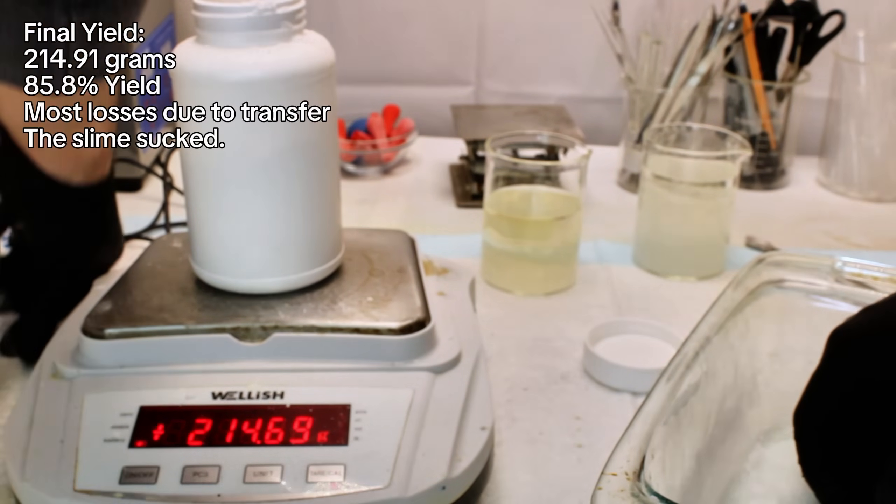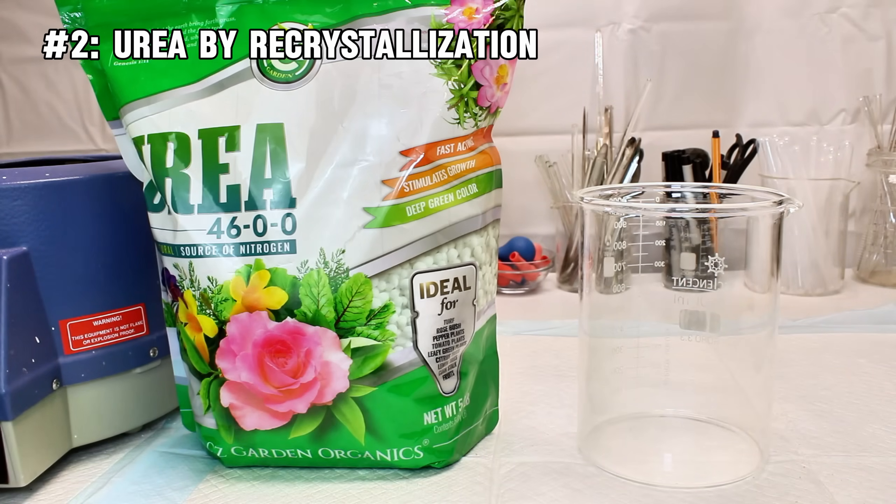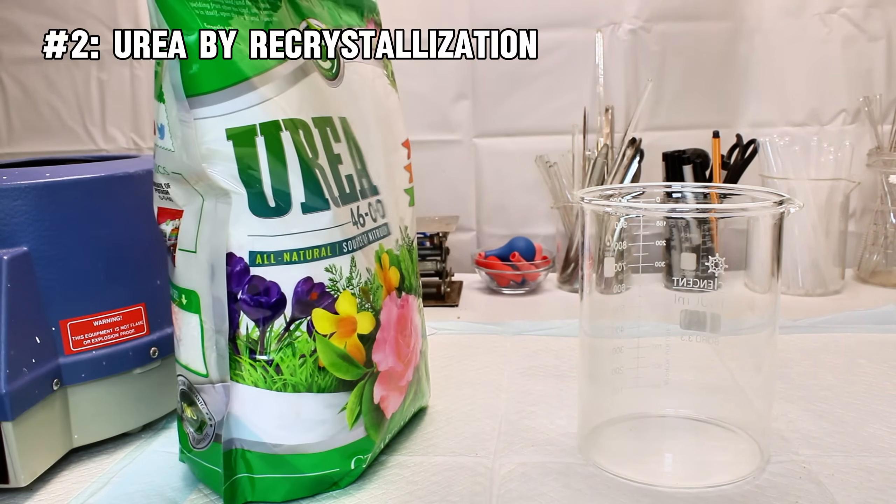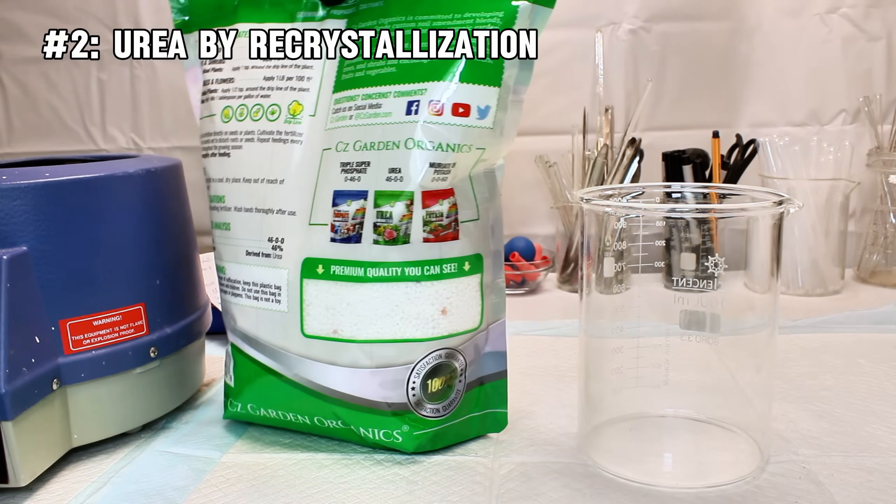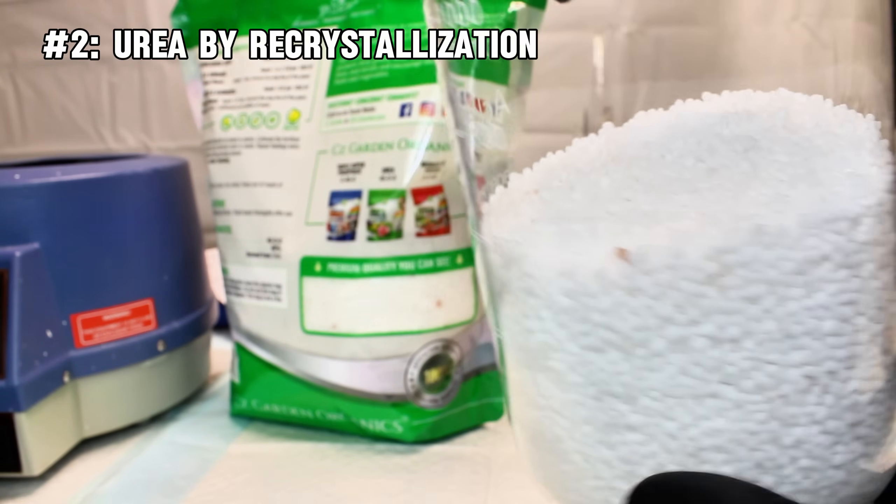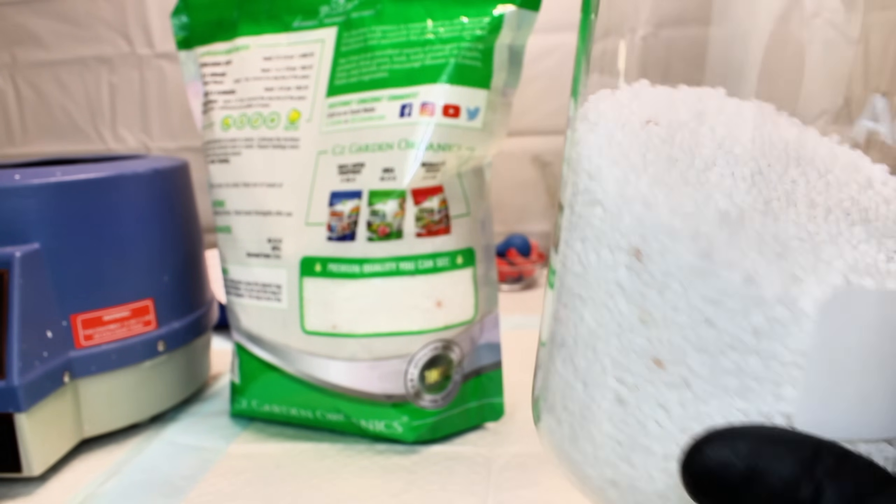For the next chemical I'll be purifying, I've got this big bag of fertilizer-grade urea. To purify this dirty urea into something resembling reagent grade, I'll be using simple recrystallization. This is the best method for urea given its very sharp solubility curve, making it very soluble in hot water and significantly less soluble in cold water.